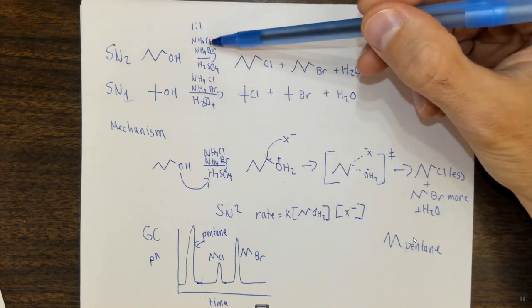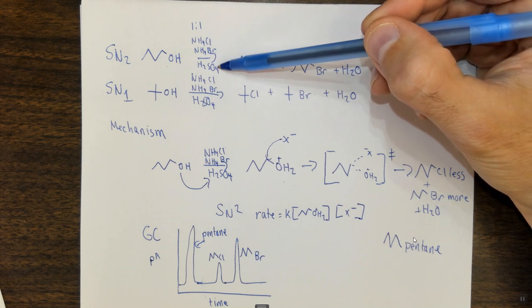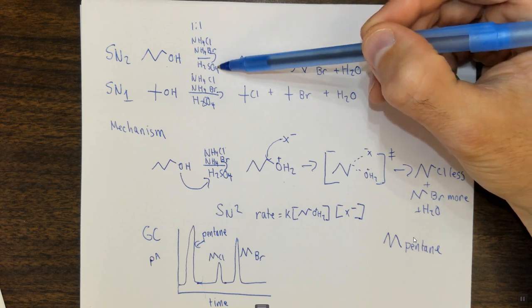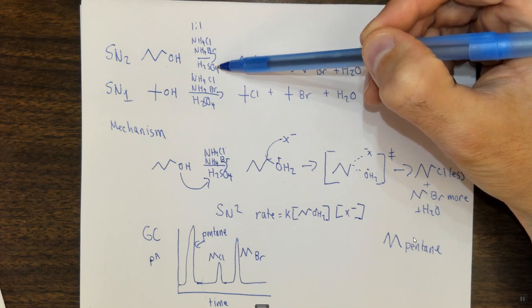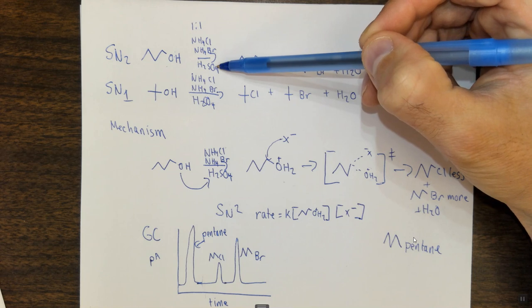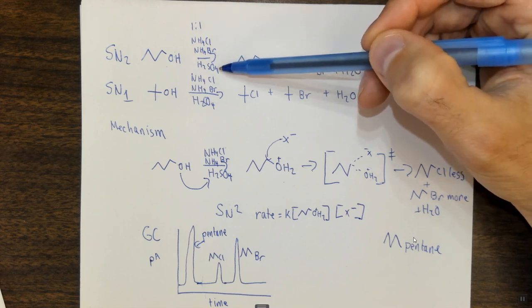To prepare this nucleophilic medium, the first thing you're going to do is take your sulfuric acid. You're going to use 10 milliliters of concentrated sulfuric acid, and you're going to add it to 30 grams of ice. This is very important because this dilutes the acid. It also cools the acid down.